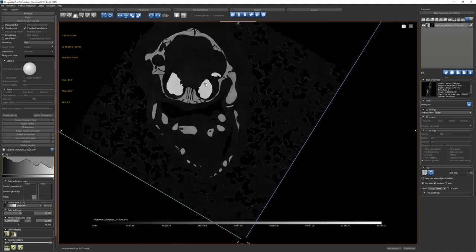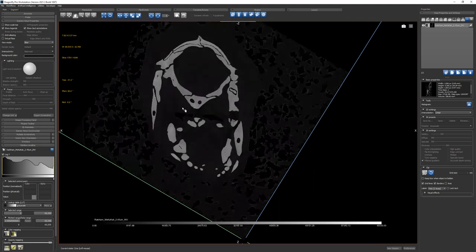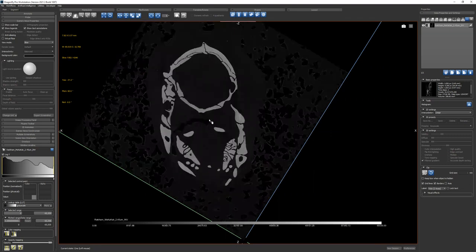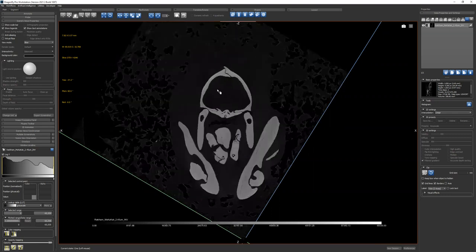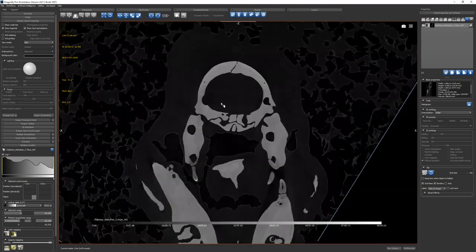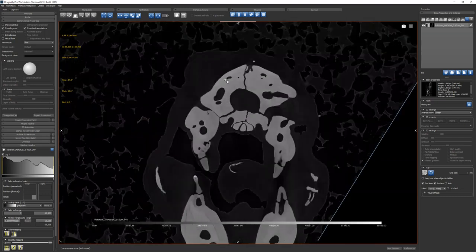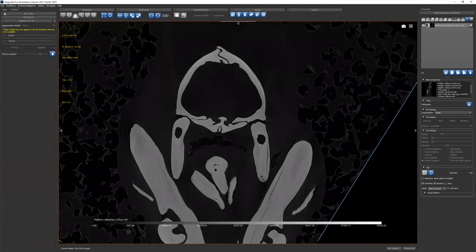And we have neurocranium here, which is composed of a bunch of different bones. And yeah, this will be really a good example and a simple example, I think. So if you're going to make a segmentation, you have two views in Dragonfly. You have this main tab and you have a segmentation tab. Click over to your segmentation tab.